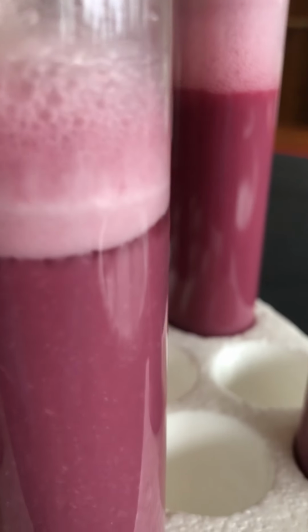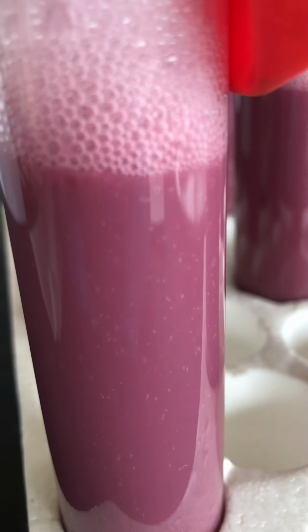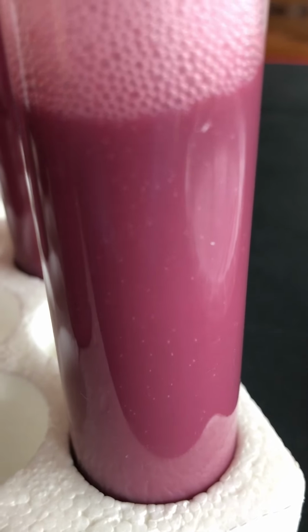Interestingly, if I were to look at this one then, the bubbles are also moving. This one is exposed to the atmosphere, whereas this one is not. And you can see a clear difference in the fermentation rates if we only look at bubble movement. So this one, again, is open to the atmosphere, so it's an oxygen-rich environment, at least at the headspace of the bubbles. Here, this one, again, the bubbles are moving pretty quickly.